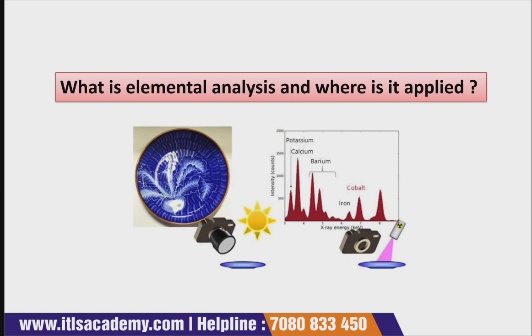And like we all know, different types of techniques are used to determine the purity of any compounds or purity of any substances. So how does this elemental analysis help in knowing the purity of any substance, and how is it used in different fields, for example in food industries, in environmental sciences? So how is it used?